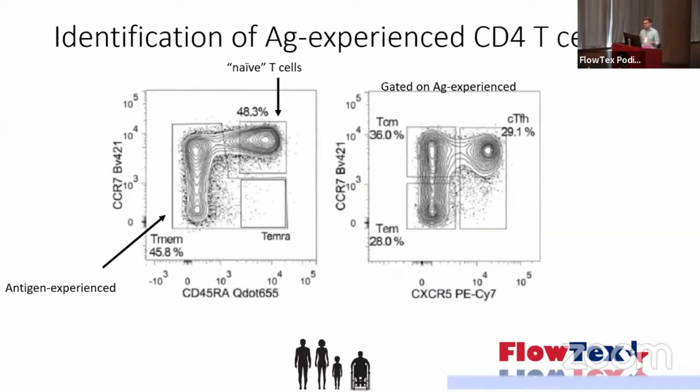In addition, we can also identify things like memory cells. I'm not going to get too far into this again, but these can be identified using various chemokine receptors. And again, this is all pitch data.